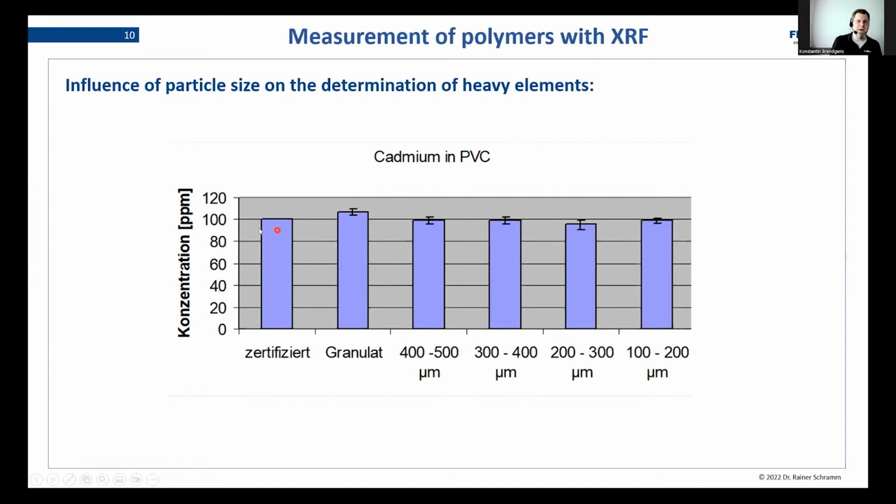And as you can see, there is a certain effect here, but it's not as drastic. We're talking about 10 ppm maybe. So in this case, cadmium being heavier than titanium, having a higher atomic number, the effect is not that profound or heavy.